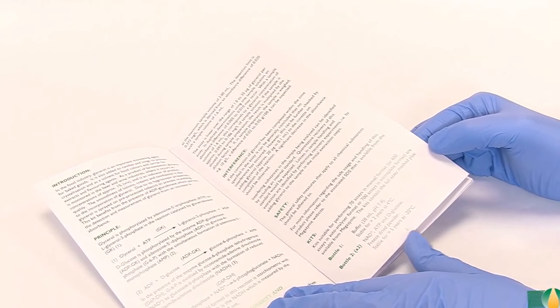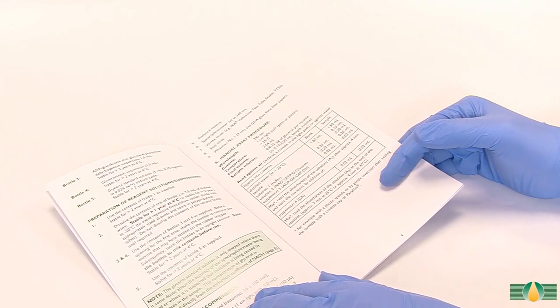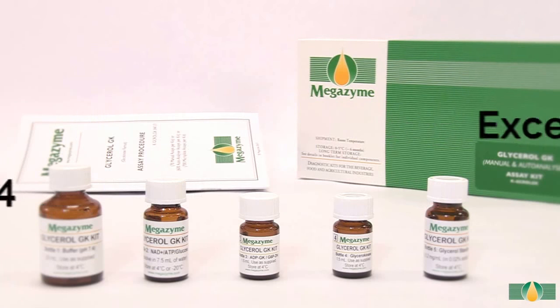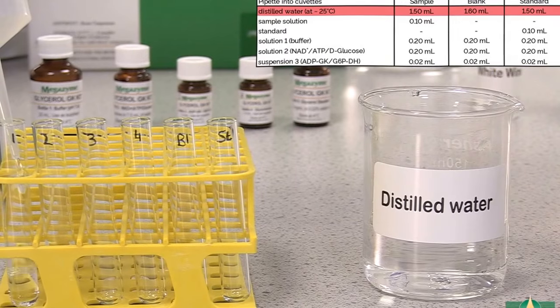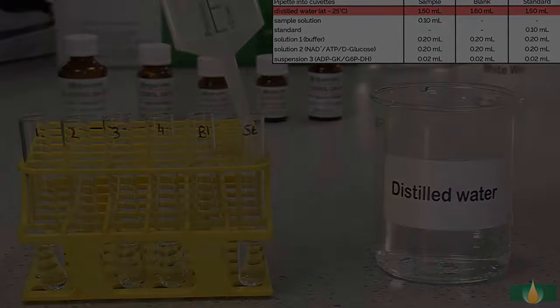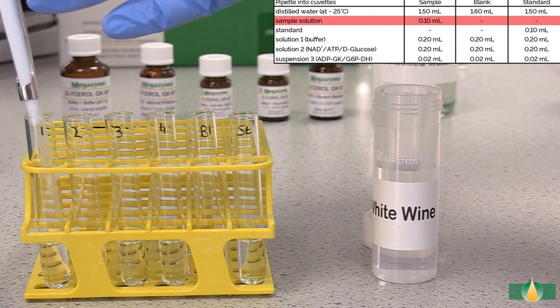Follow the manual assay procedure as described in the data booklet. Pipette all assay components except the final trigger enzyme in bottle 4 into each assay tube. A blank reaction and a standard reaction must be performed with each batch of samples. Pipette 1.5 millilitres of distilled water into all assay tubes, then pipette 0.1 millilitres of sample into the sample assay tubes.